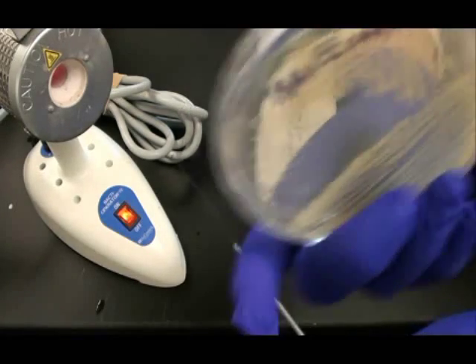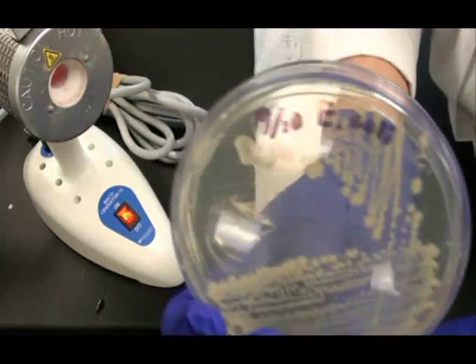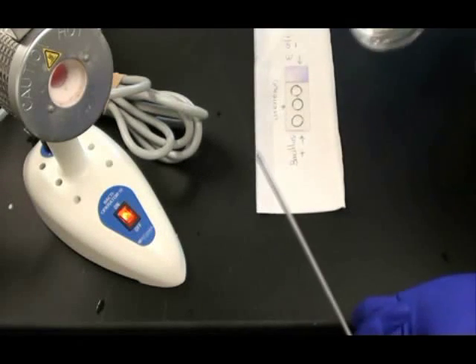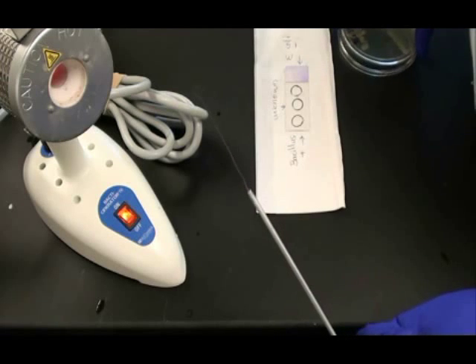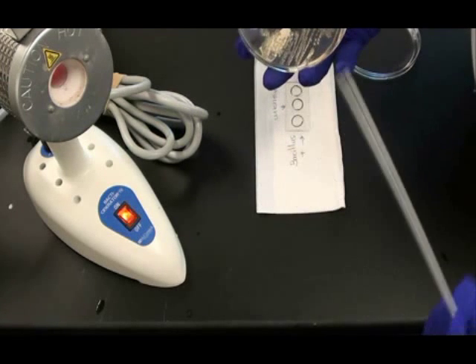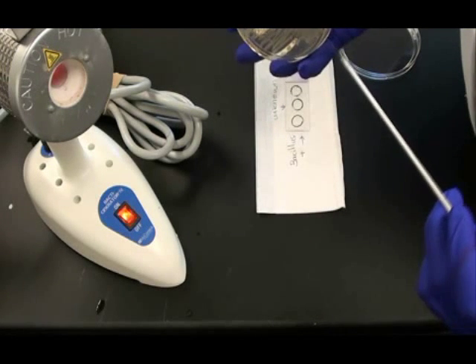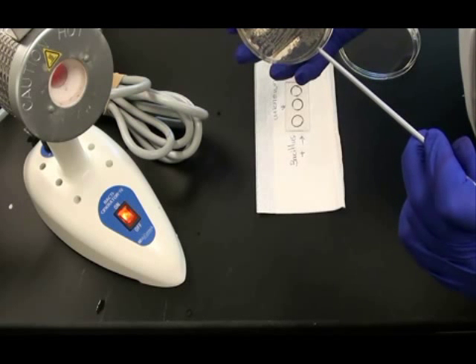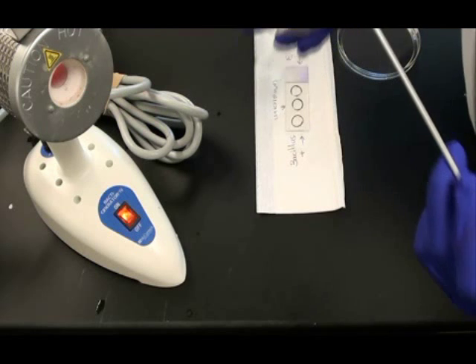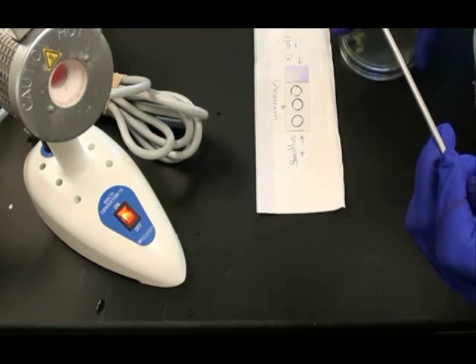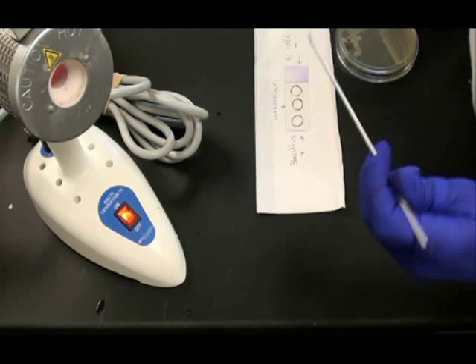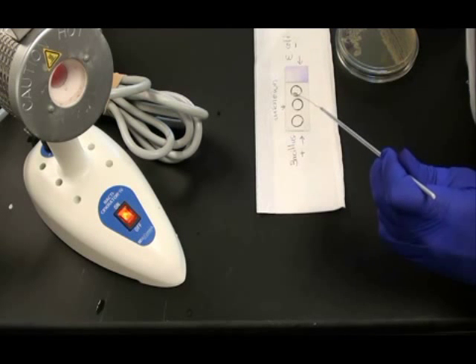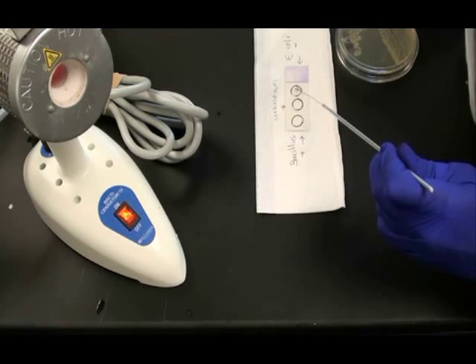I'm going to start with my negative control E. coli, which does not produce endospores. That's why it's my negative control. I will take my cooled inoculation loop and very gently grab a colony of E. coli off of the plate. Then I take that sample and I swirl it in the water on the right side of the slide in the right circle.